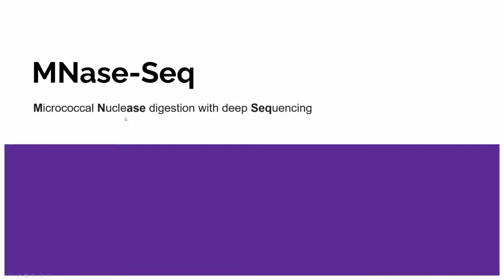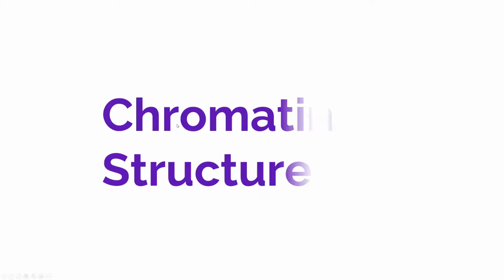Hello, today we'll be talking about MNase-Seq, which stands for micrococcal nuclease digestion with deep sequencing, and is a method to identify open chromatin. First, we'll talk about chromatin structure.